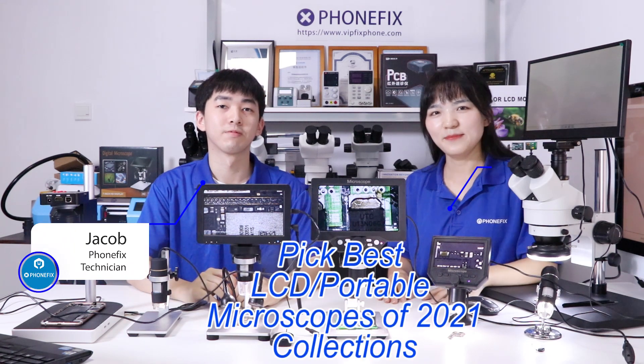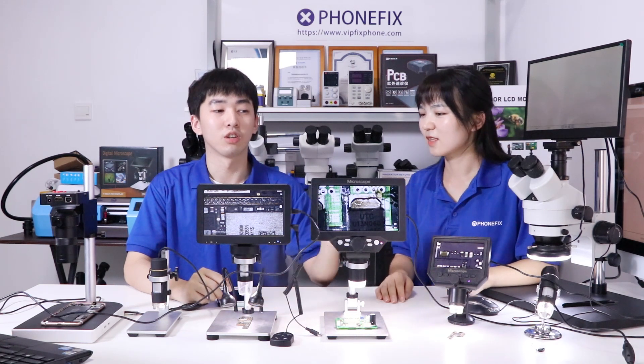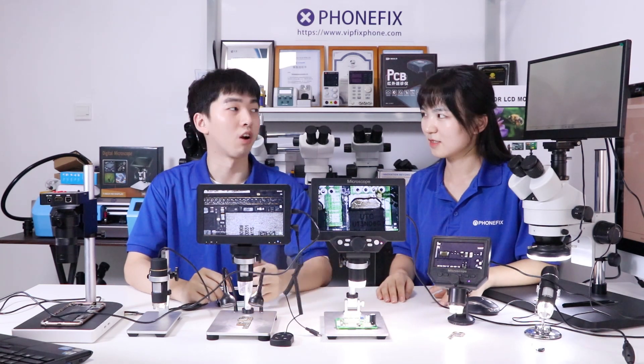Hi guys, here is China Phonx. I'm Draco. And Phoebe. Today we are going to show you this microscope. We will mainly introduce this LCD display microscope.